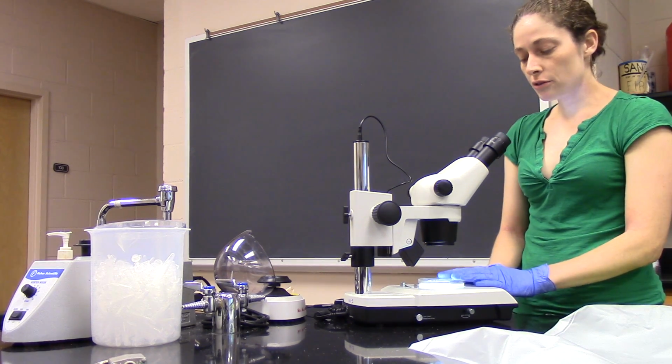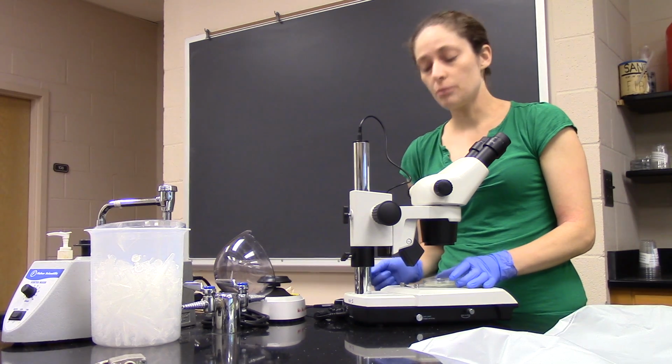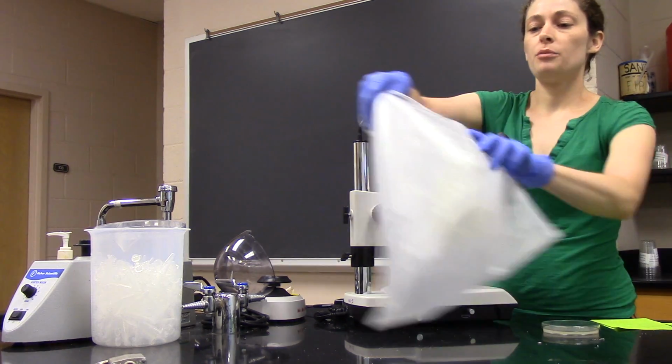When you're all done with the microscope, you always want to make sure that you turn the main power supply off, and ideally also turn the side lights off and put the cover back.